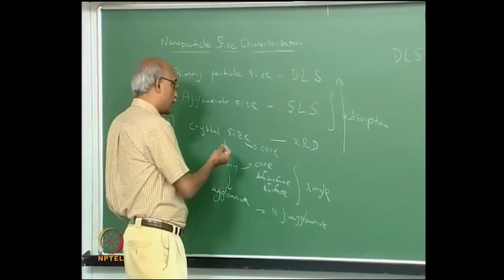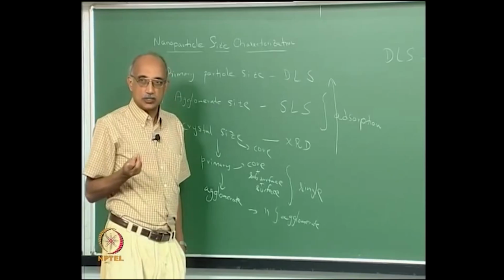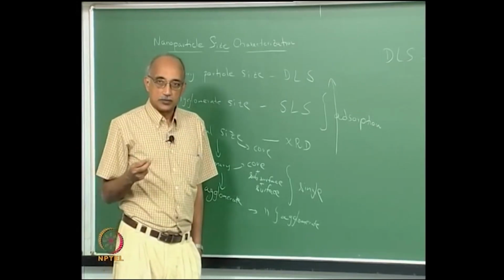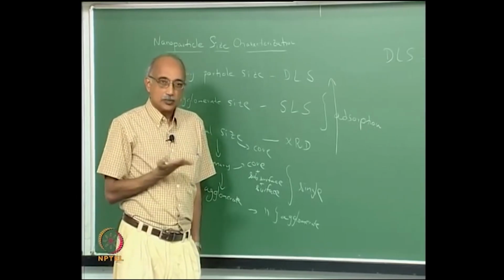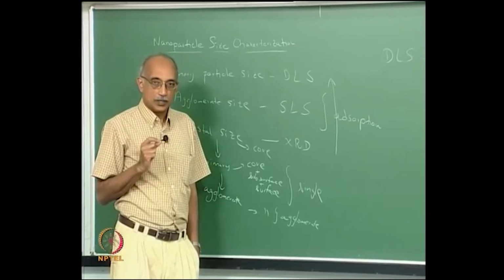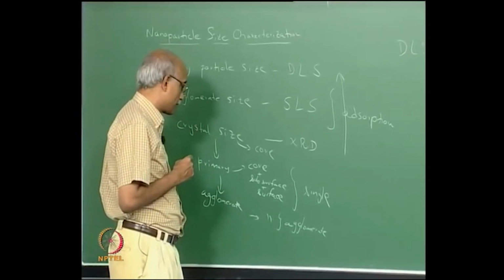Of course, if you have an amorphous particle, then the use of XRD becomes somewhat questionable, because XRD is a technique that's very, very sensitive to analysis of crystalline materials, but when you have a more amorphous material, the signals that you get from the XRD tend to be a little more diffuse, and it becomes more difficult, particularly to analyze the data in a quantitative fashion and extract dimensions and other types of information.